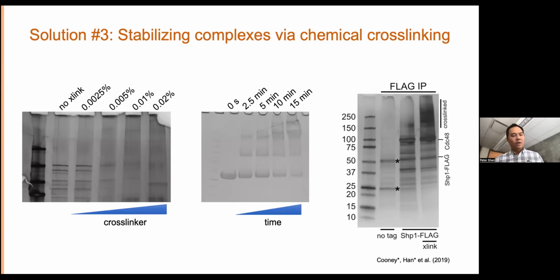And so that's why I show you these couple of examples of the titrations that we do. Every time we have a new project, we do have to figure out, all right, what is a proper level of cross-linking for this particular project.